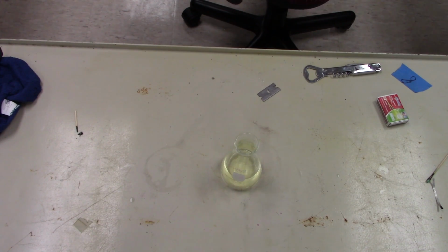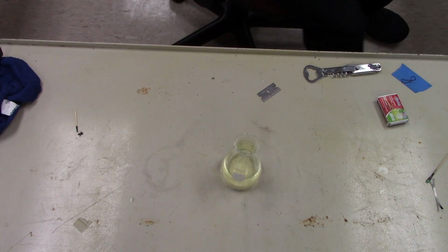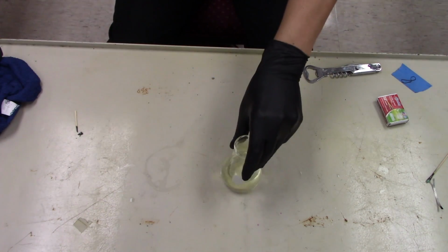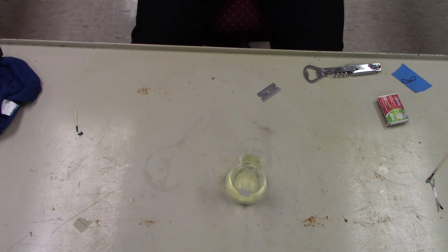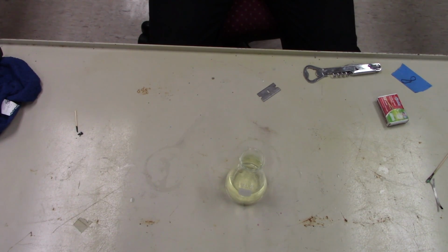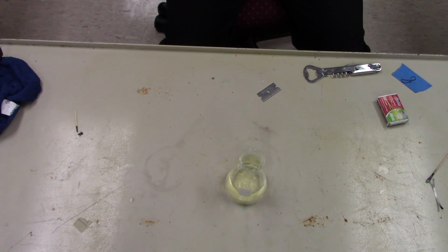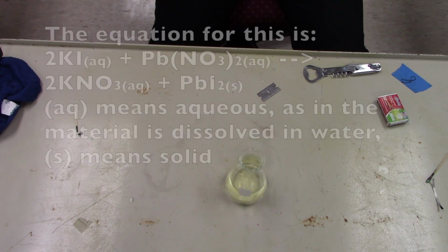And this one's kind of cool. What will happen here is we'll add just a little bit of lead nitrate to this, and make sure you can see this one because it's really cool. And it happens instantly. All right, anyways, so when I dump this in here, it's gonna change instantly. It's not gonna get hot or anything like that, but it'll change color, and as I dump this in, it'll create a solid, like instantaneously.